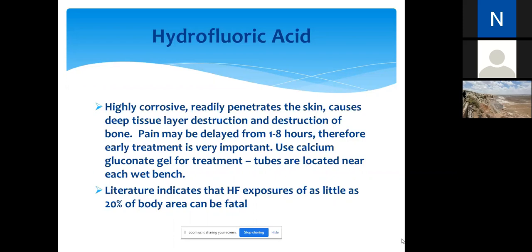because exposures to hydrofluoric acid as little as 20% can be fatal. And sometimes you don't even feel the pain. You'll be like, oh yeah, I'm fine. I don't feel any pain, even though I know I spilled HF on my arm. No, go and seek medical help.